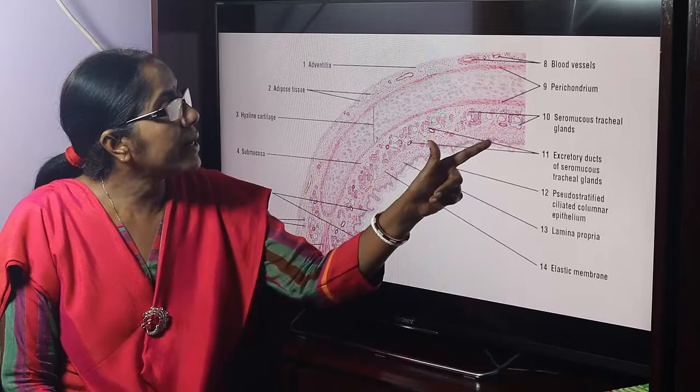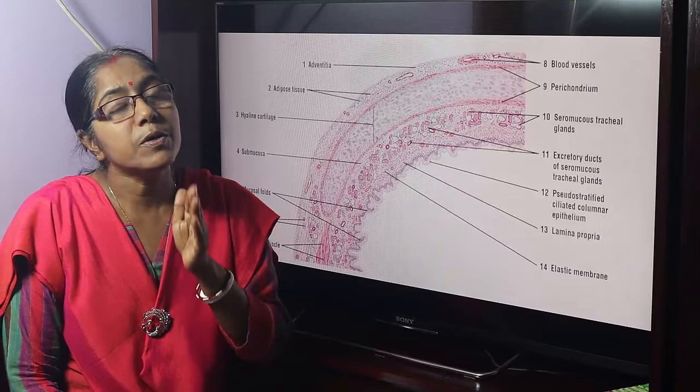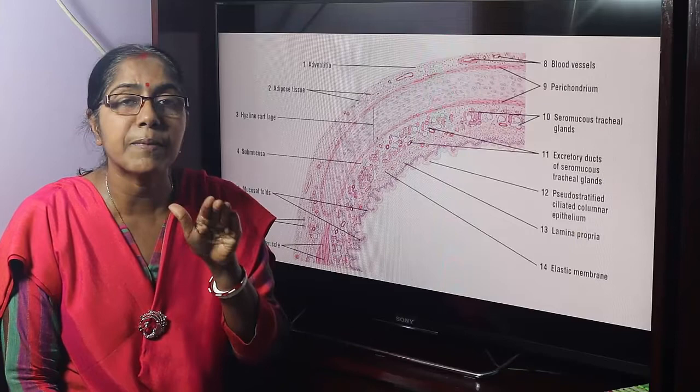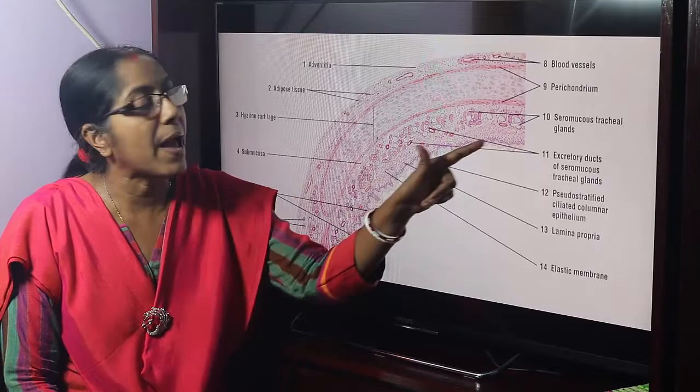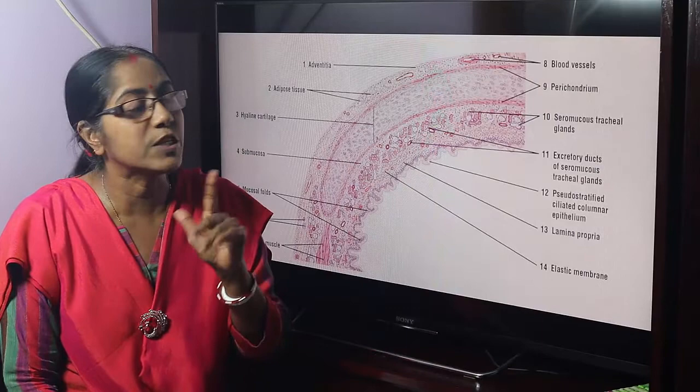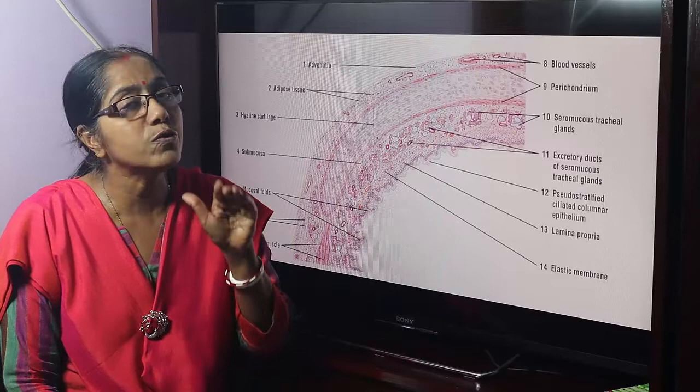Now, this is the mucosa. Mucosa is composed of three layers: lining epithelium, lamina propria, and muscularis mucosa — this applies to the digestive system. But in the case of the respiratory system, the mucosa consists of lining epithelium and lamina propria. This is the lamina propria — it is loose connective tissue. Perichondrium is dense connective tissue; lamina propria is loose connective tissue.